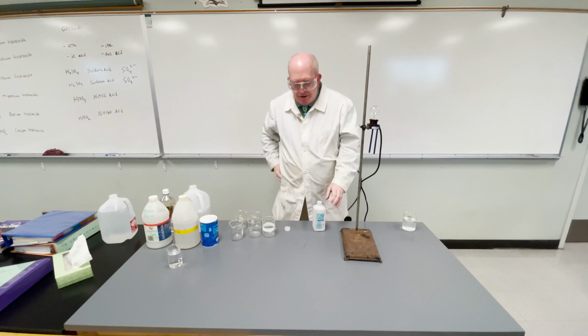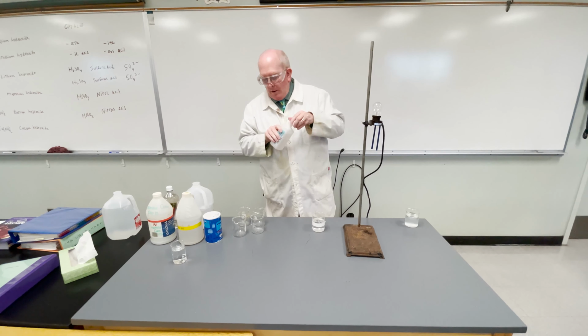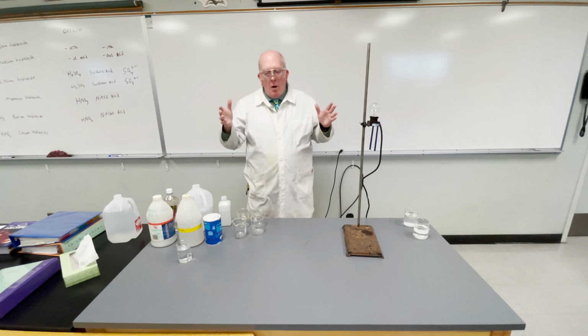So, open that up that way. And I'm going to take a bunch of it into the beaker. The amounts really aren't critical for what we're doing today, okay? Whether just a little or a lot, doesn't matter. Take this beaker, put it there, and you see no conduction. None whatsoever, okay? Now, just to keep things from contamination, I'm going to rinse that off again. You'll notice I'm not sticking my fingers in there. Okay, now, a strong electrolyte, like sodium chloride, dissociates fully.